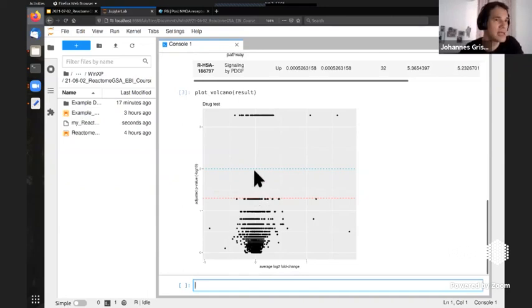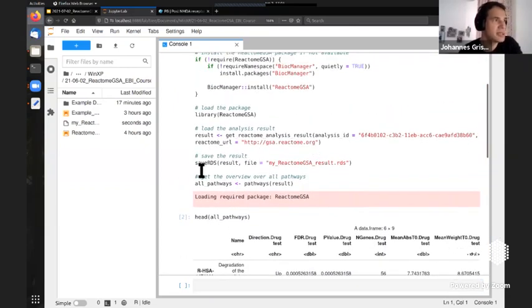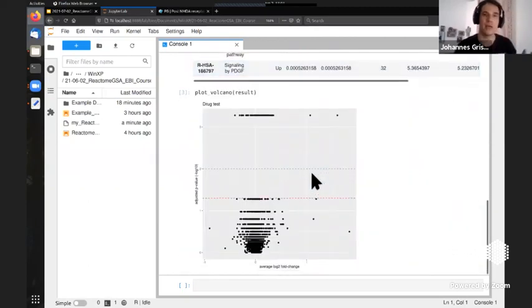And in the R script, we actually put in this save RDS file command. So immediately the file is saved here. And this is kind of your source data, right? So you can load it again. And when you need to update some plots for your figures, you can use this RDS file on your computer to update your plots if you do them in R, for example. So this is quite nice to kind of immediately jump into R and continue working there and have your results there.